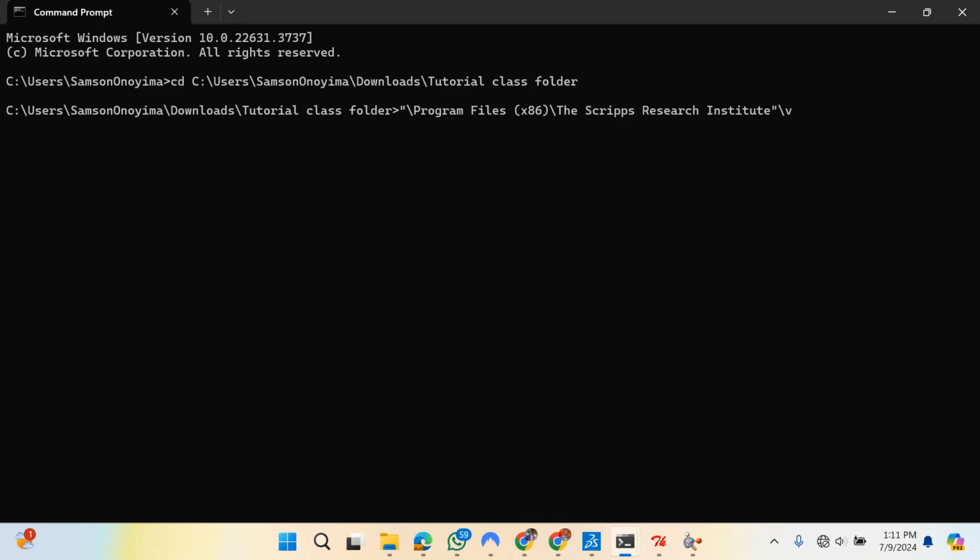If you hit tab again, the Vina will appear. Then inside the Vina, I'm looking for Vina dot... the forward slash. Okay, let's see. If you put forward slash, you see what it's giving you. What do you notice is happening here? Maybe not, the file is saved in the folder.